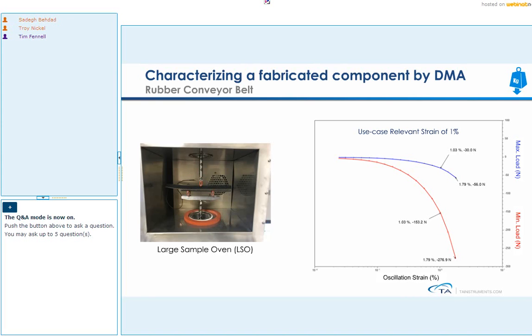So this is a compression test. That's why the values are negative and everything is below zero. At around 1%, because this was a log scale, the test measurements are spaced so that they're evenly distributed along a log axis. That's why it's not exactly 1% here.